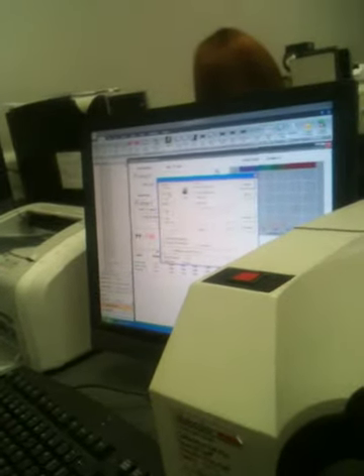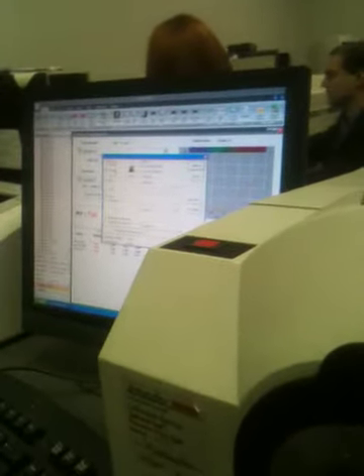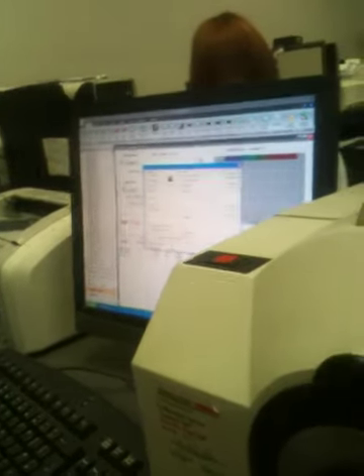You will learn it from, I don't know if you actually have a class on the spectrophotometer yet or not, but you'll probably understand in the class that in the geometry of this machine there is a small area where you could include or exclude the light that passes through, and he will tell you about the significance, alright?